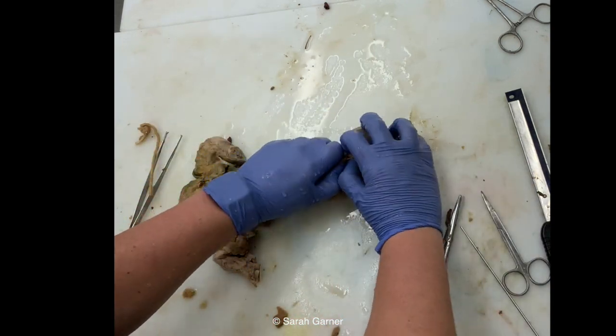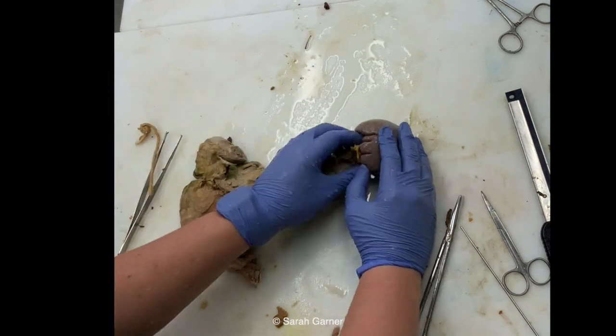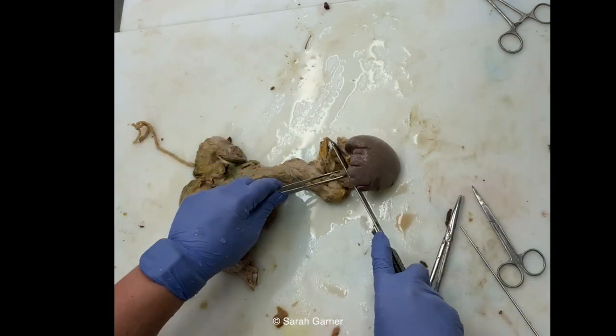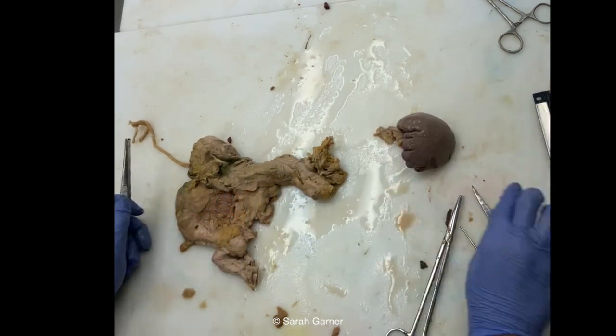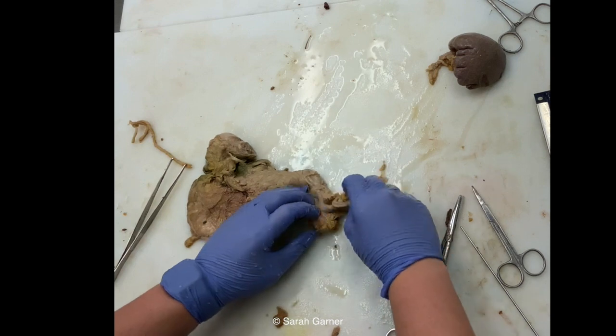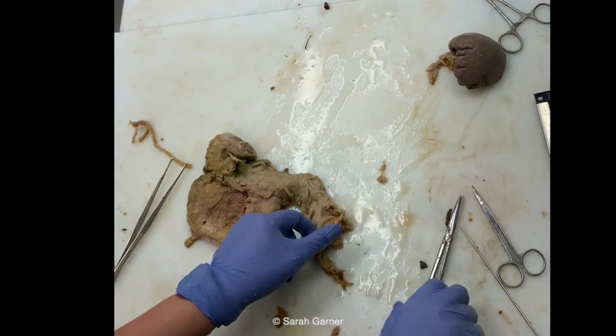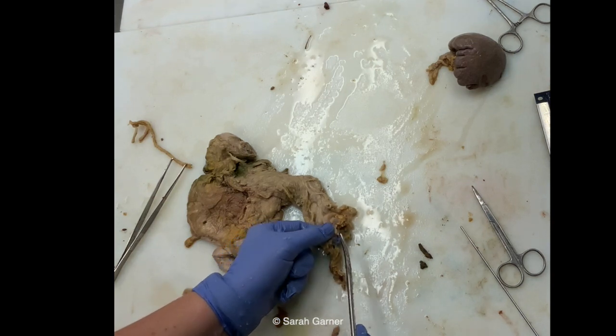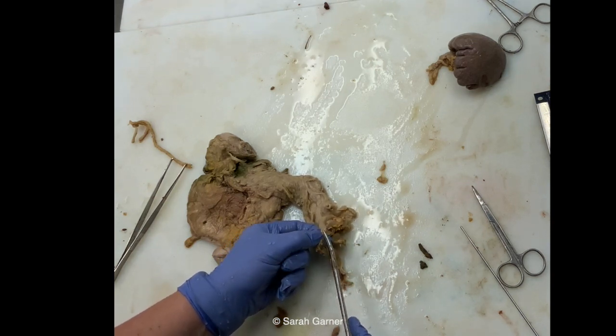So unless you're looking for something particular or you're trying to do a specific dissection, typically you're going to be okay just cutting the splenic vessels here and removing the spleen. Then you will weigh the spleen and serially section it. So that can be removed. And then, if you wanted to open up those splenic vessels just to check, you should be thorough, you can actually open up.